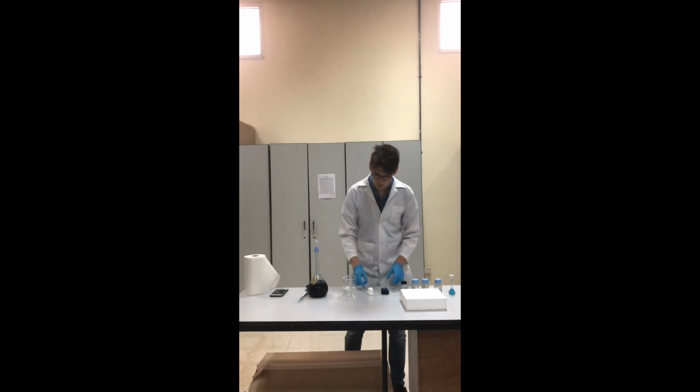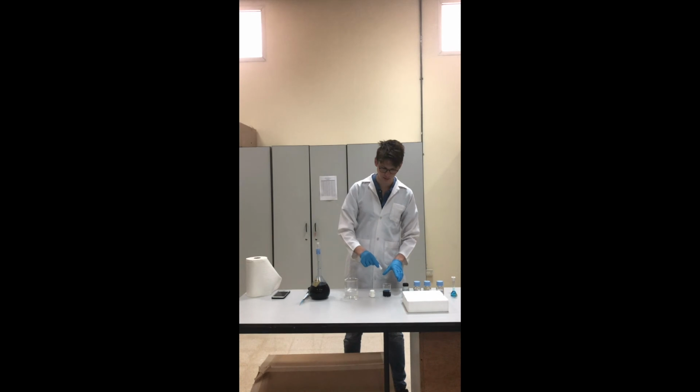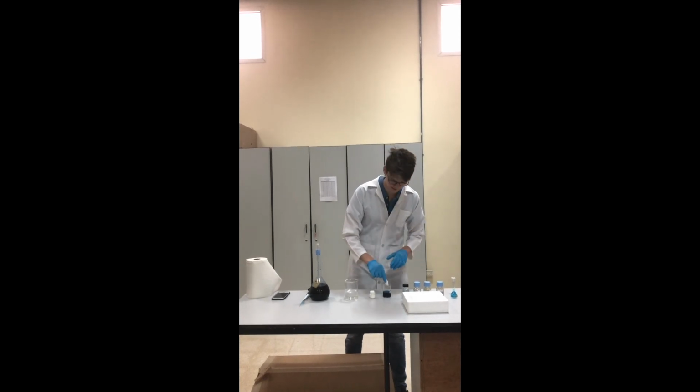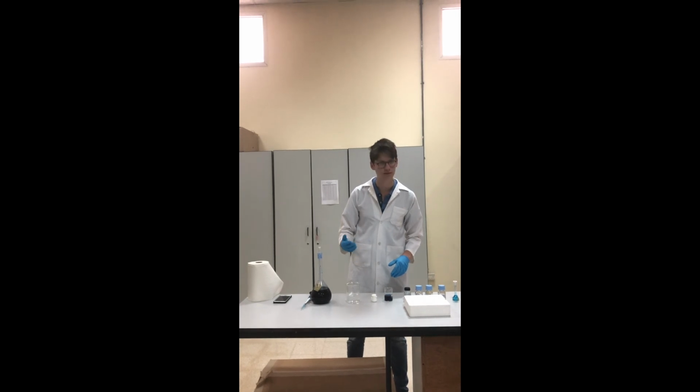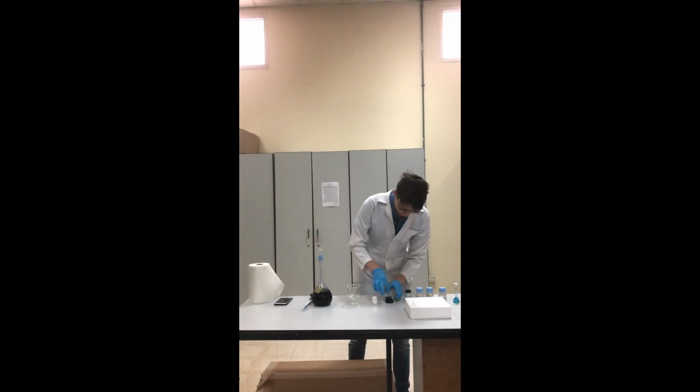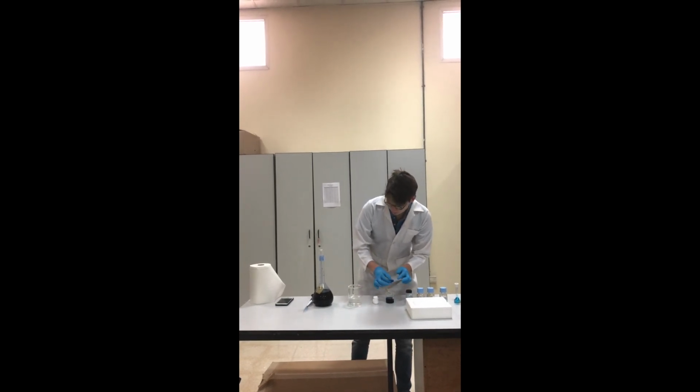Next, we're going to put a gauze into the stock solution. We're going to leave it in for 10 seconds. So, done. We're going to get the gauze and put it into the room temperature water.